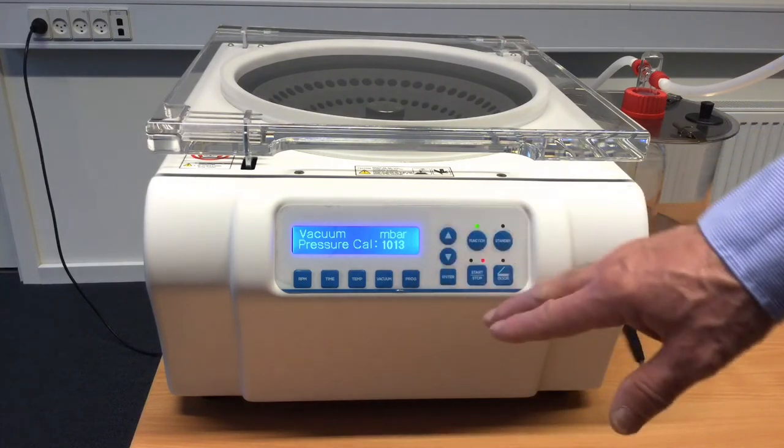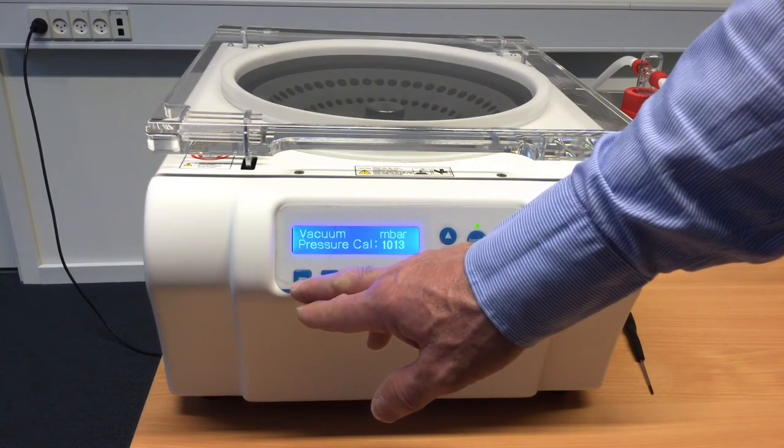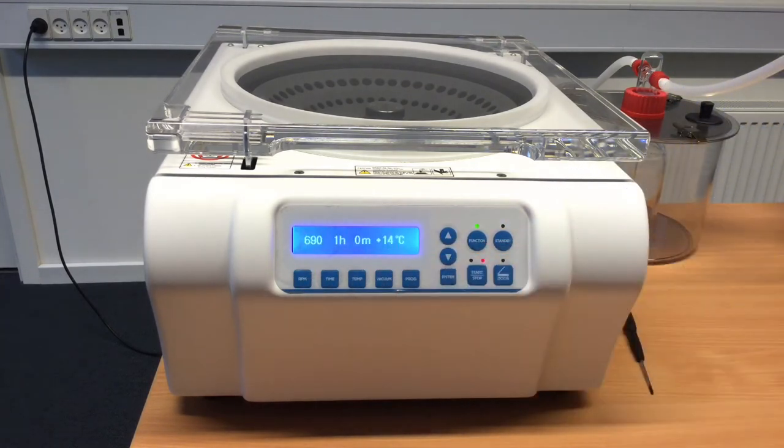We can make small programs where we specify a certain RPM, a certain time, and a certain temperature. These can be stored under different program numbers, going from 0 up to 99 programs.